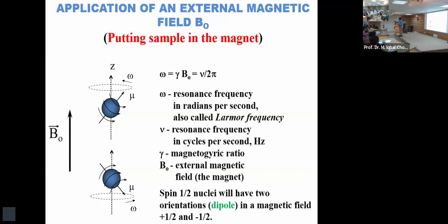Even if you have two compounds in one mixture, there's going to be some kind of interaction. Intermolecular interaction is so important. Even solvent is another compound, right? The solvent in which you dissolve your compound is another compound. The solvent would have an effect on your, if you have paramagnetic, we would study that also.